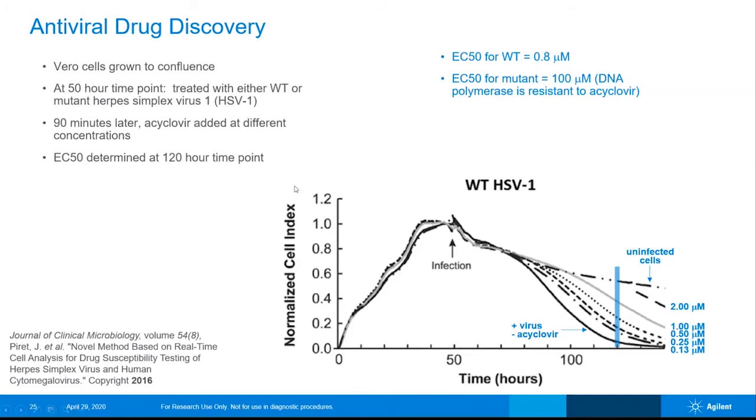So this gives you a sense for the way the assay can be used, not just to identify whether a drug has an impact, like in a high throughput screen, but to then pull quantitative information out of the assay.